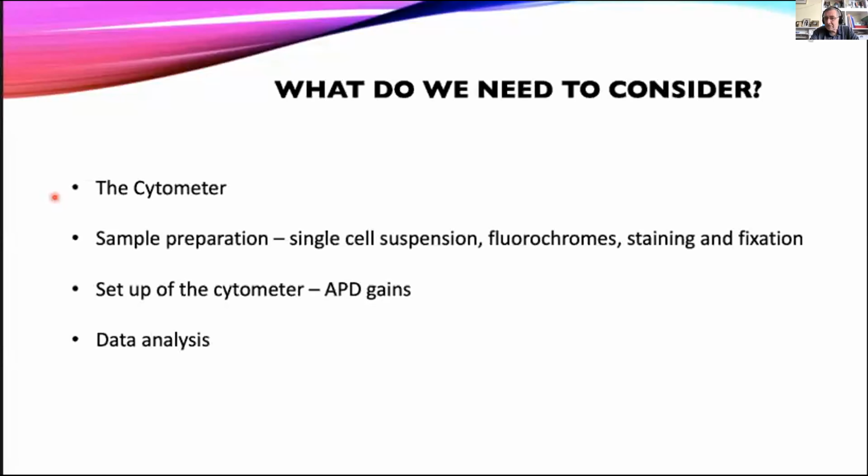You'll probably be able to cover 99% plus of the experiments you want to do. But not everybody is that lucky, of course. You may be in an impoverished institute, you may be in a small startup company. So always the cytometer is going to be your first port of call. It manages your expectations of the type and how complex the experiment can be.